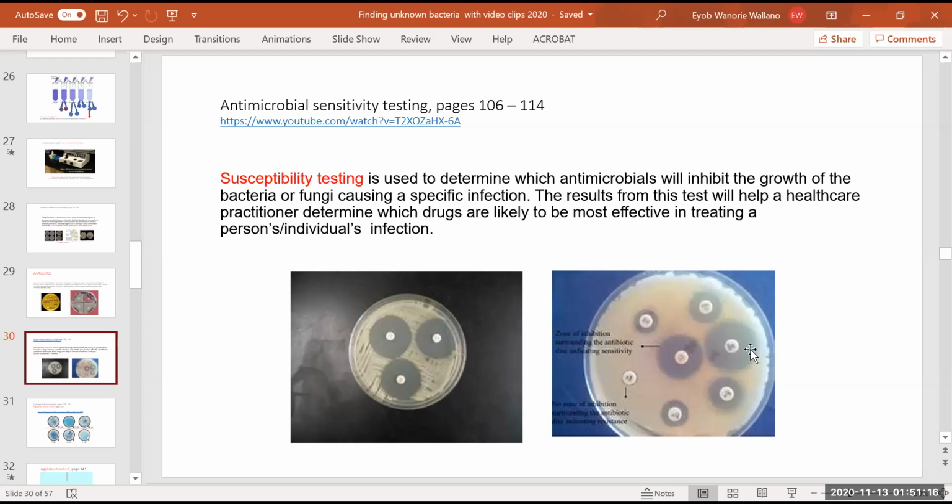Look now, it covered almost all the surface. So here you are saying this is broad spectrum, this is broad spectrum. Now this is resistant. Do you see that? That is inhibition, and then susceptibility. The doctor is not going to prescribe medication like this one. If streptomycin is resistant, the doctor will not prescribe it, but may prescribe this one or this one. That means we call it the inhibition test.